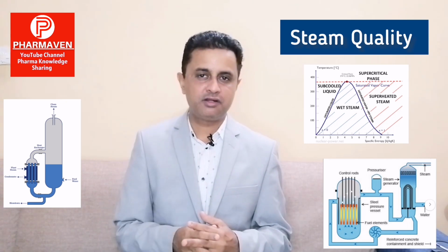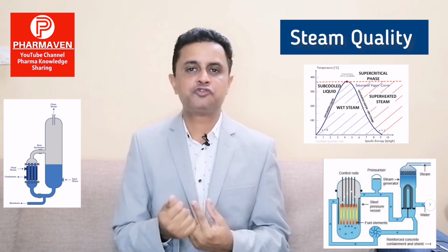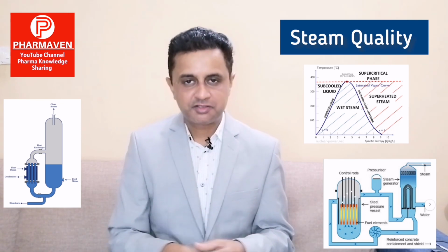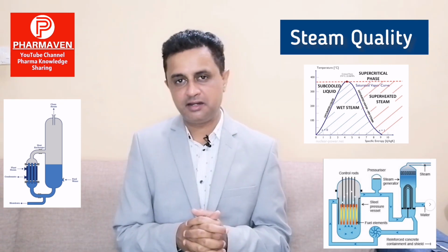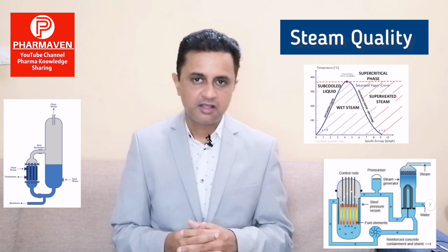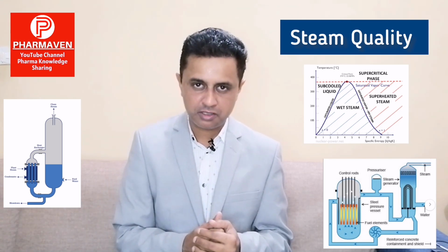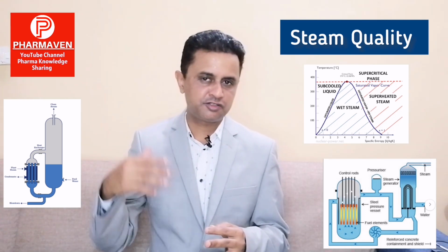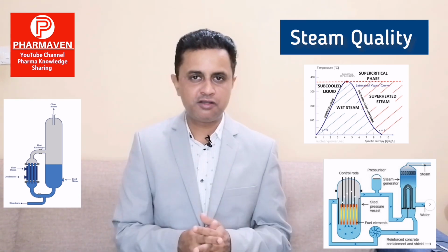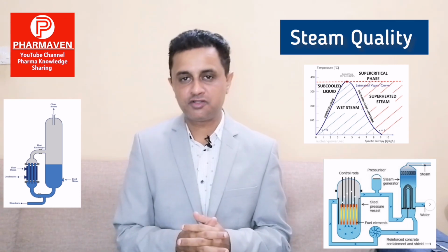So coming to the steam quality, also check whether the dryness value, superheated value, saturated steam, and non-condensable gases are all meeting the criteria. Normally steam quality testing is done every 6 months. Some companies also do the steam quality testing exactly before qualifying an autoclave, during the initial qualification as well as during requalification, to ensure that the steam quality is meeting the criteria and will not cause any failure.